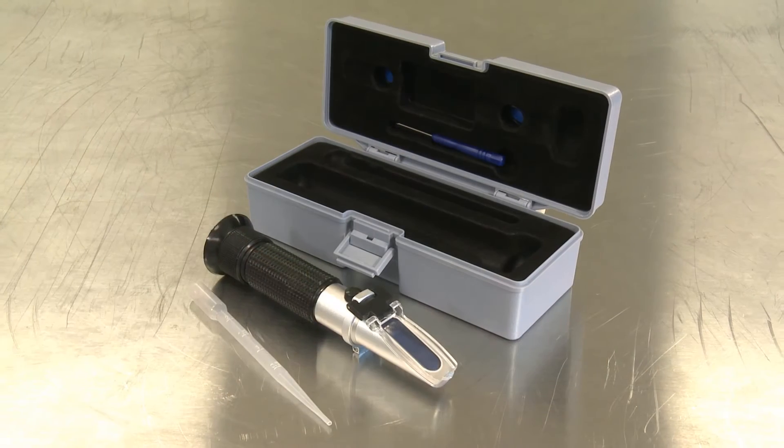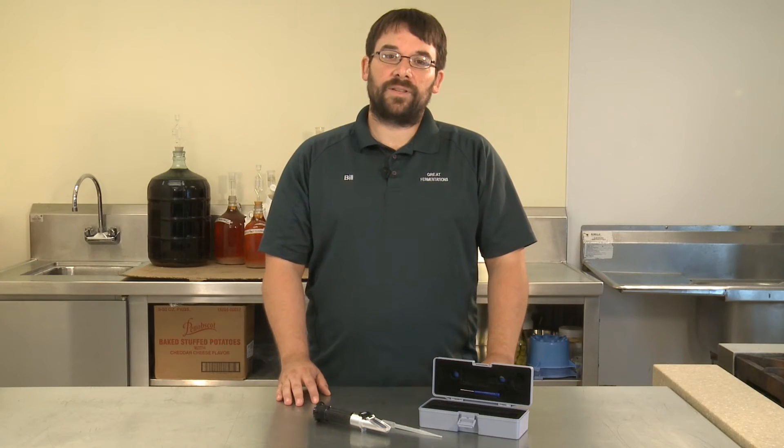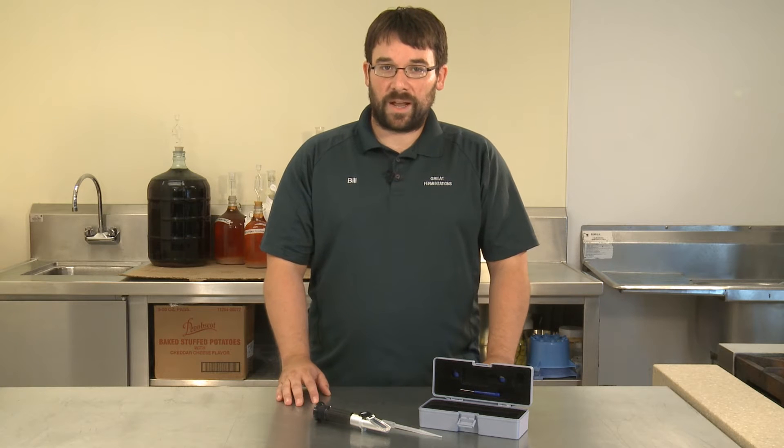A refractometer measures the sugar content of a liquid solution, whether it be beer or wine, and it does that using the brix or the specific gravity scale.